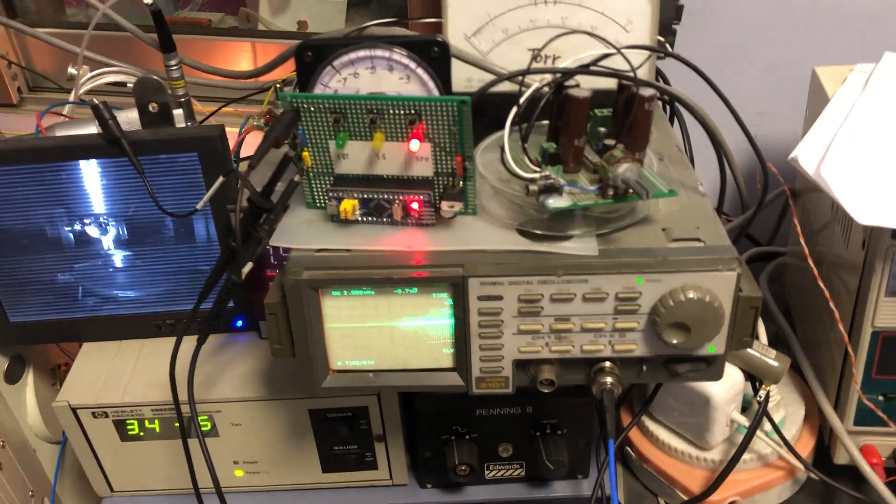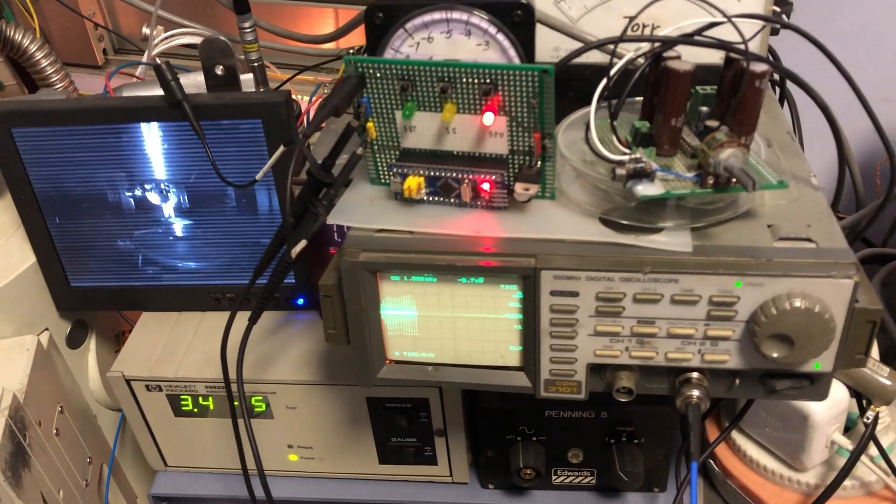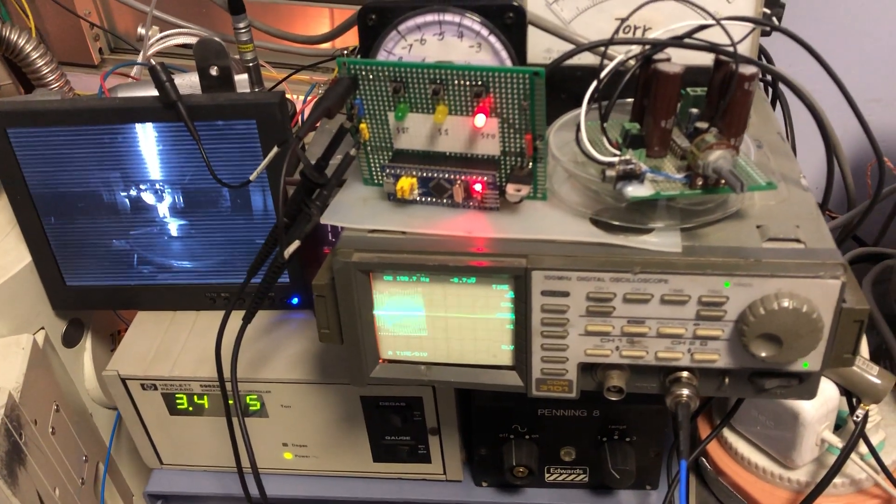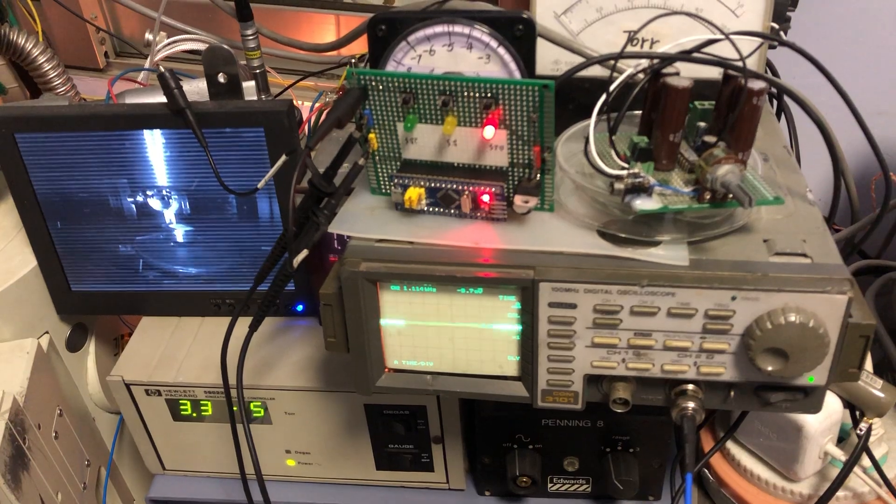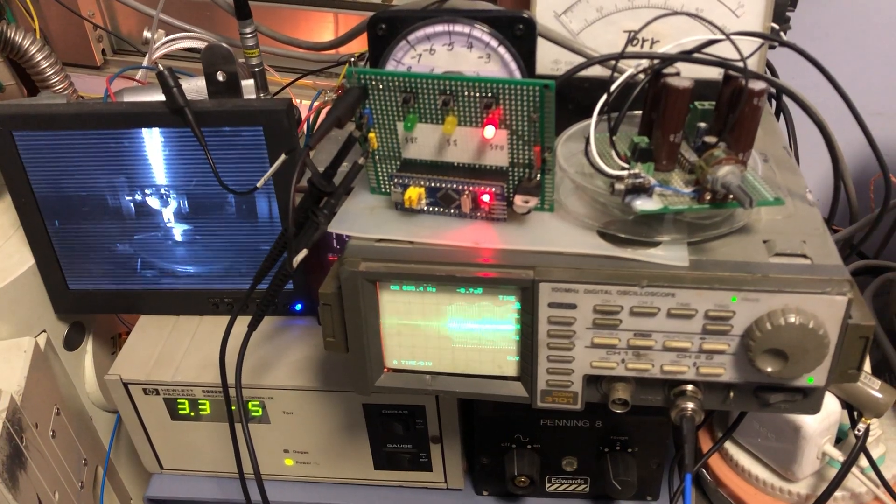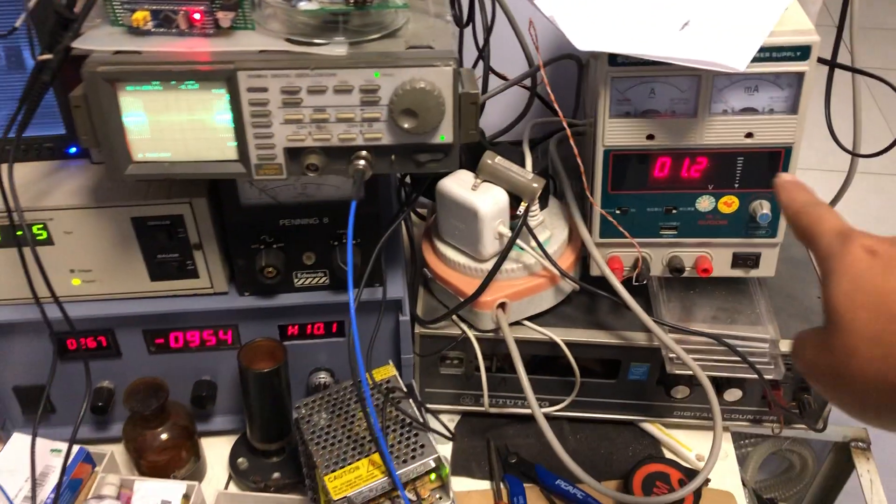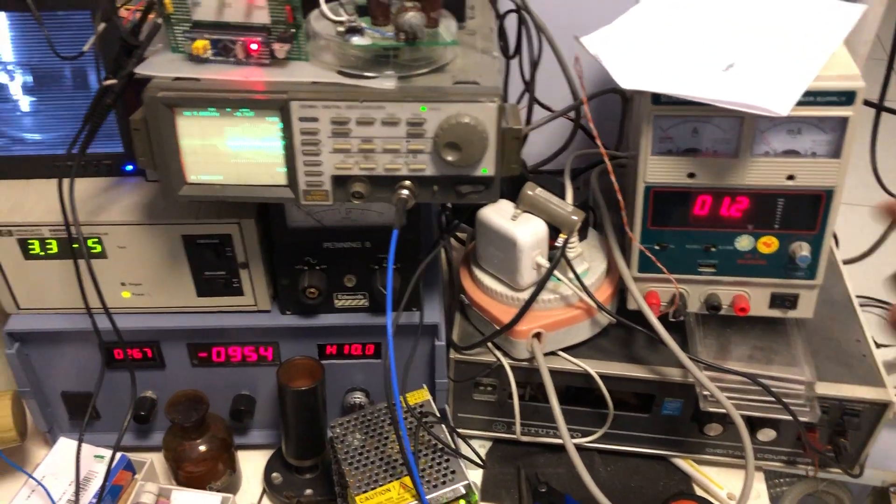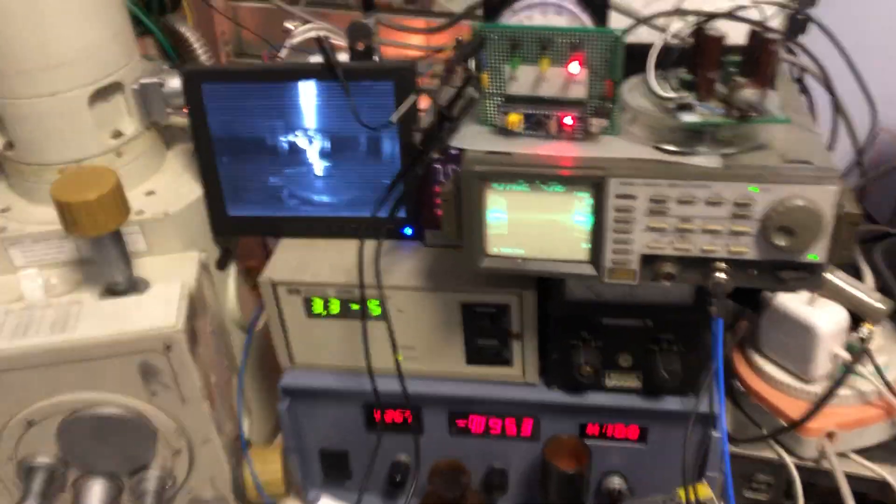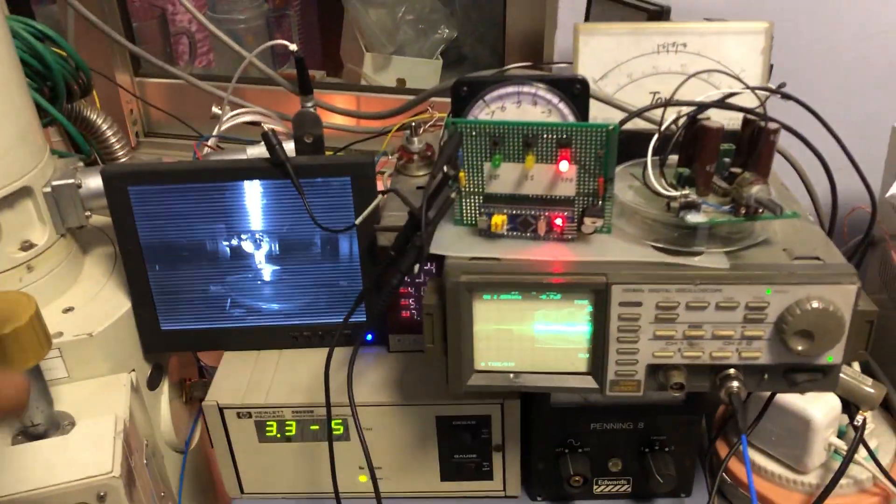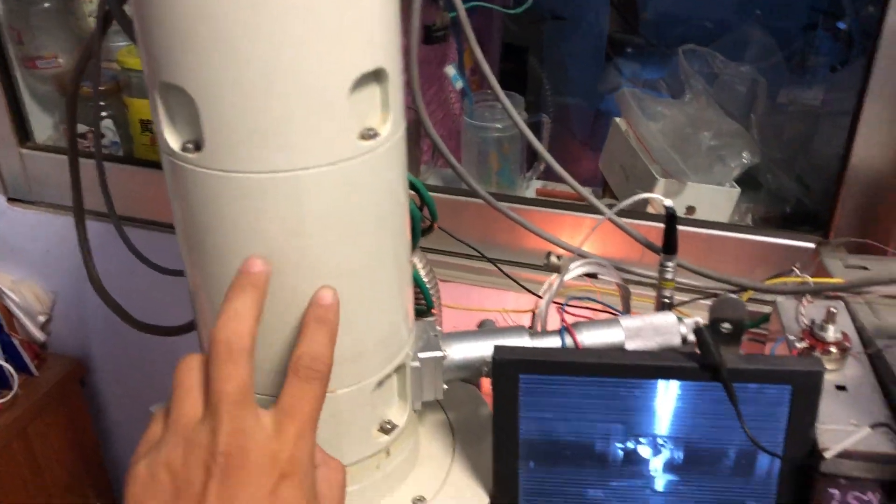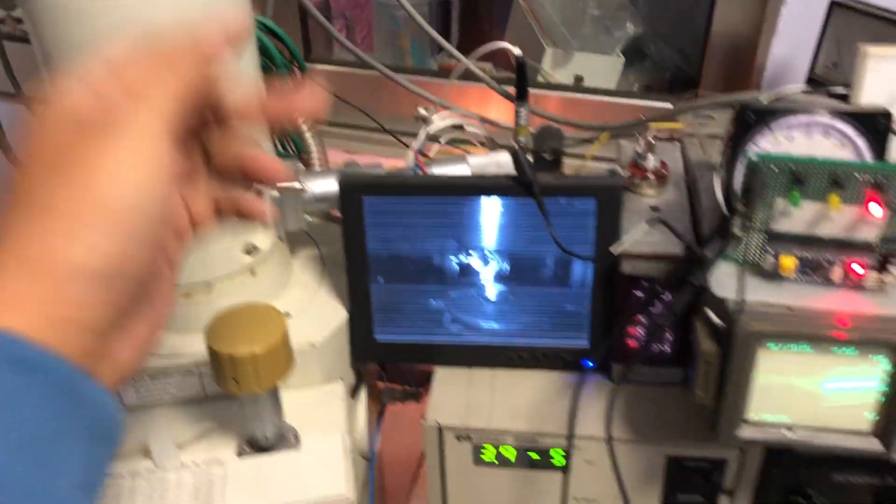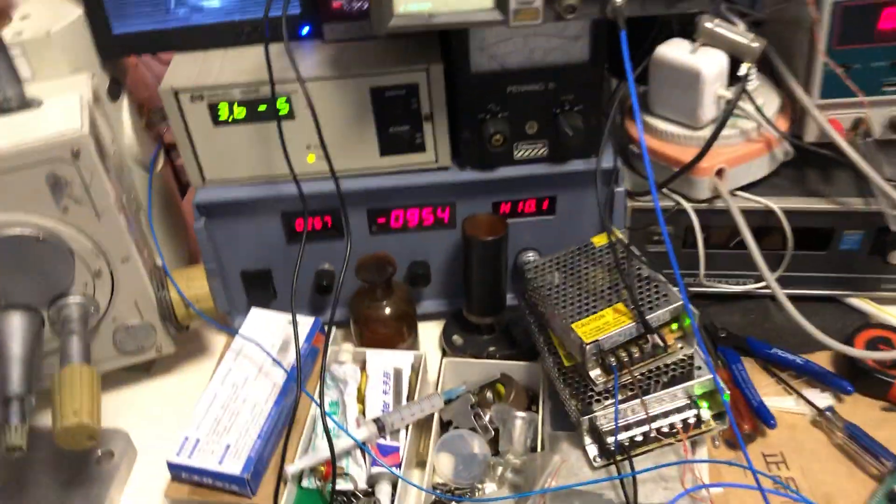Here is the focus power supply driving the focus coil inside the column.